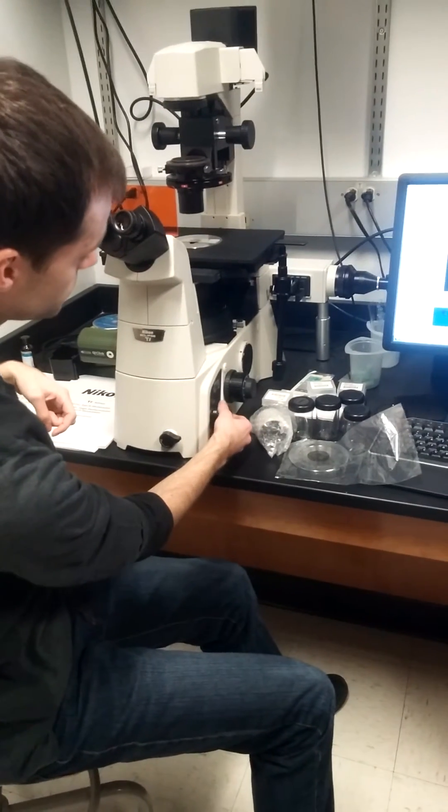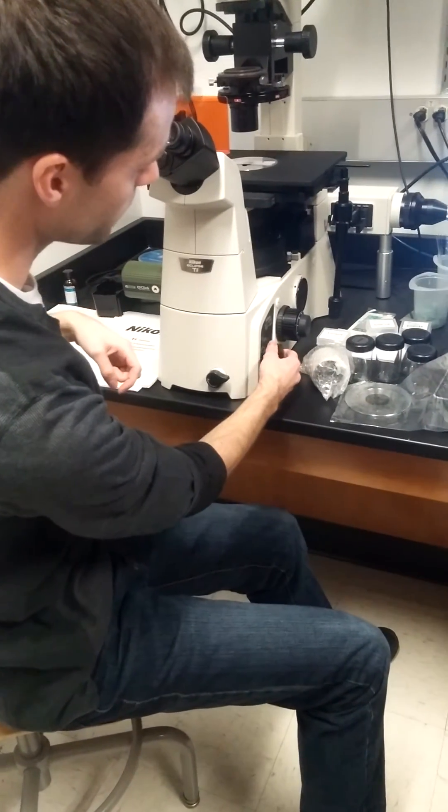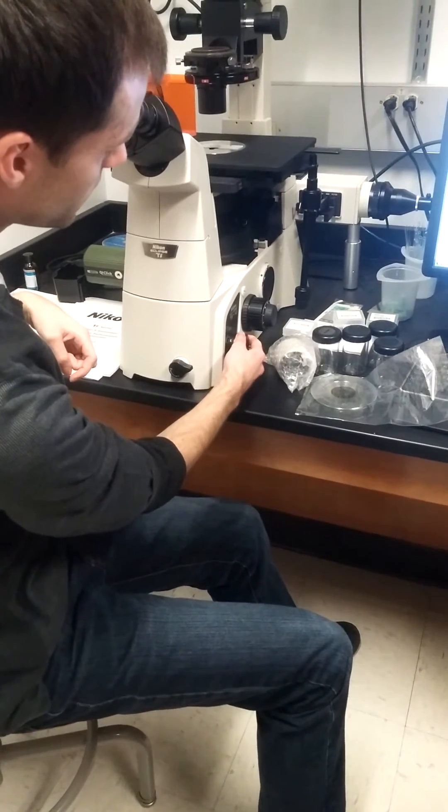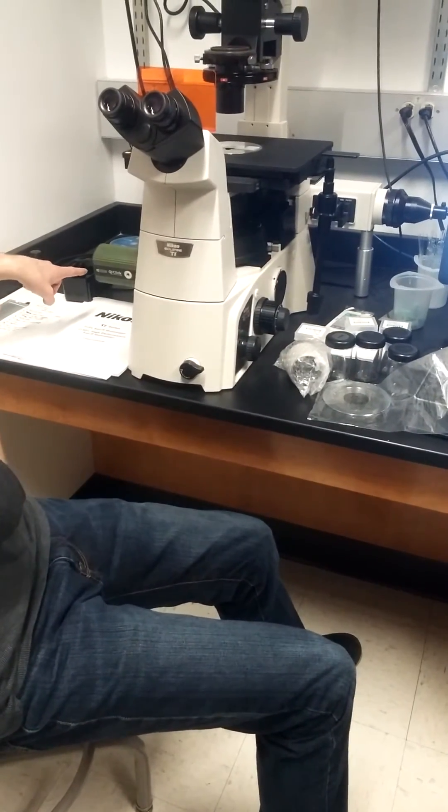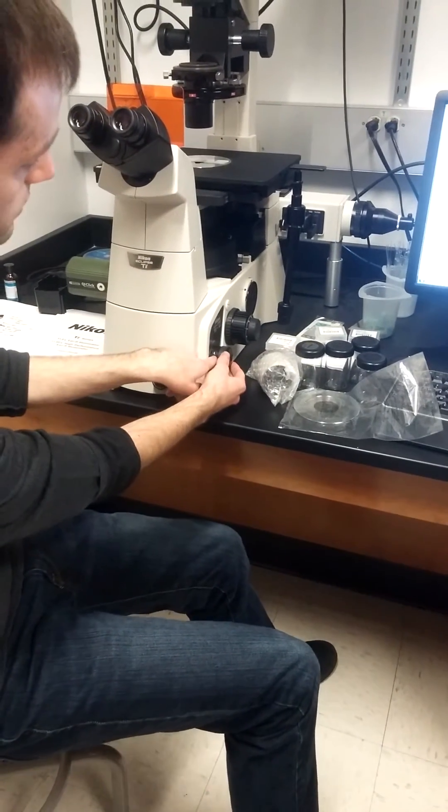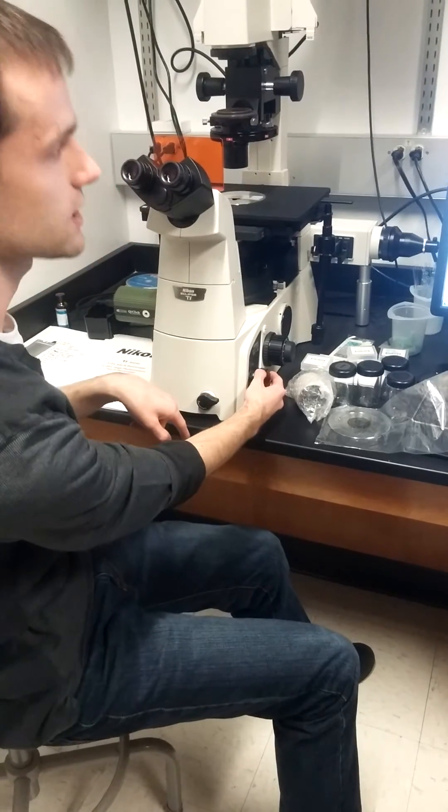And we'll get a black screen because right now we have the light path running through the objective lenses here. So we're going to adjust the port to run through the left-hand port, which is where our camera is located. So basically we just switch from I to the L, which stands for left.